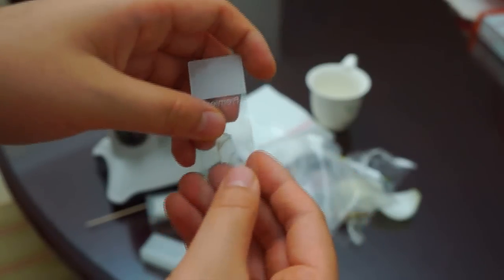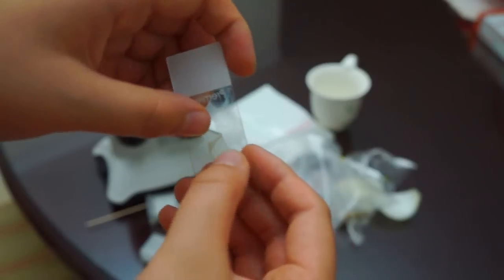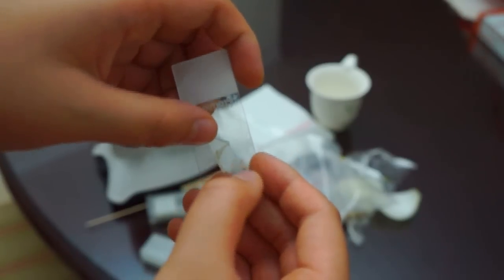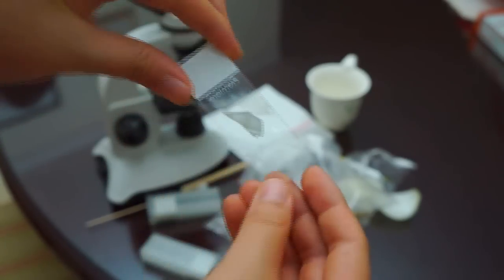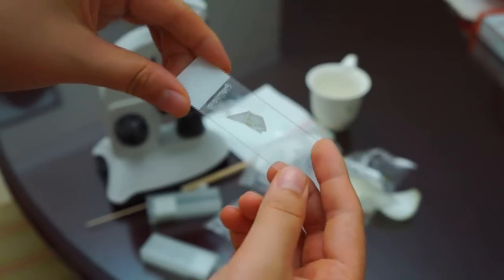Now we have the outer part, transparent part, and we'll pull it. We're going to spread it all across the slide to have it really thin, so we can check it out easily.